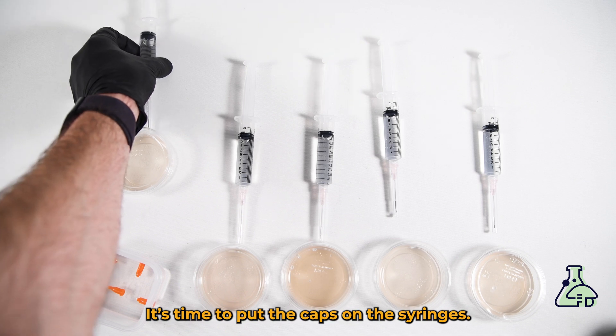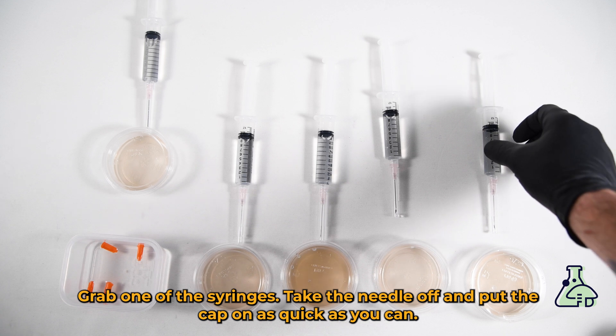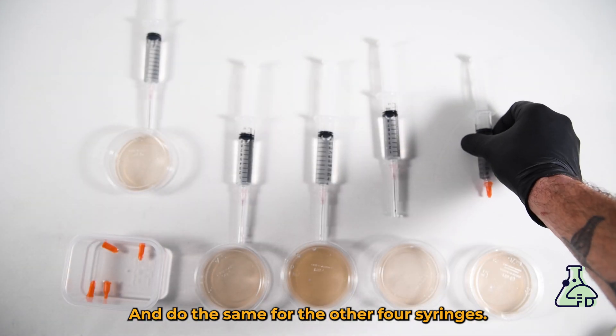It's time to put the caps on the syringes. Grab one of the caps from the isopropyl alcohol bath, grab one of the syringes, take the needle off, and put the cap on as quickly as you can. Do the same for the other four syringes.